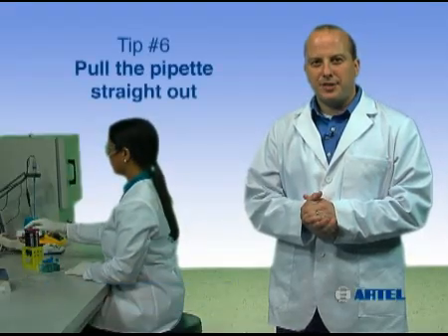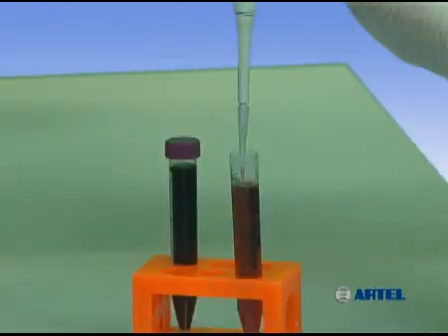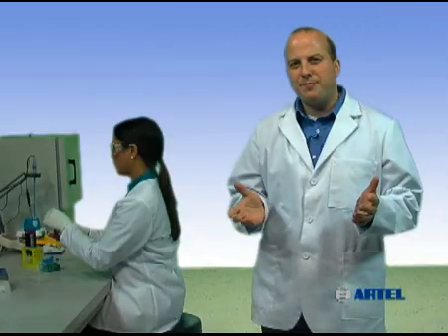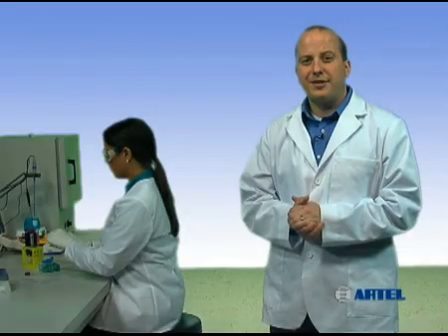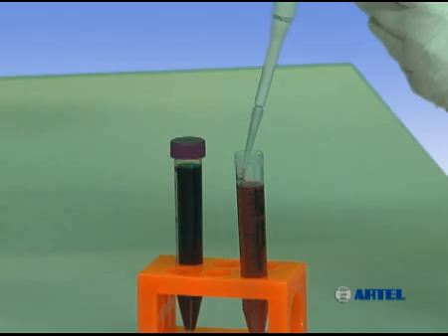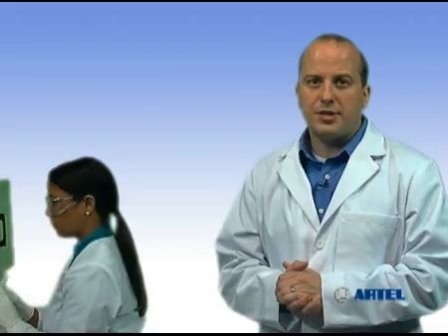Pipetting tip number six: pull the pipet straight out of the container after aspirating a sample. Make sure not to touch the tip on the side of the container as it's being removed. This is especially important when pipetting small volumes such as less than 50 microliters. Surface tension effects may cause the sample volumes to vary if the pipet is not pulled out vertically. Varying the exit angle or touching the tip against the container walls may result in wicking or loss of sample as the tip is removed, leading to lower target volumes or inconsistent volume transfers.